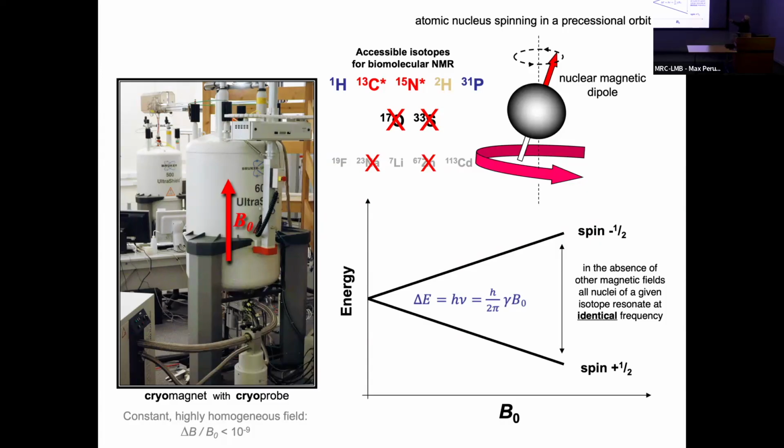The other one that we use quite commonly is substitution with deuterium, but that's used in the opposite sense. That can make the proton NMR invisible if we exchange away some of these protons for deuterium instead. We can make that portion of the molecule NMR invisible, and there may be applications for that. There are no NMR active nuclei that are useful for oxygen or sulfur.